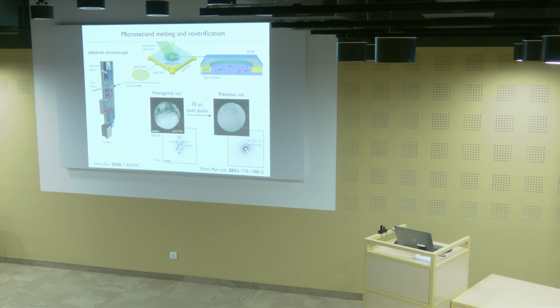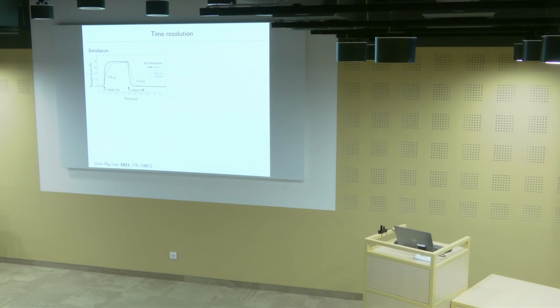All right, and so with a time-resolved instrument like this, it is a question you can answer very rapidly. This is a simulation that we'll maybe look at first. When you look at the red curve here, this is the temperature on the sample as a function of time. You can see that when you switch on the laser, the temperature shoots up. It does so with a time constant of about 1 microsecond, and then the temperature stabilizes.